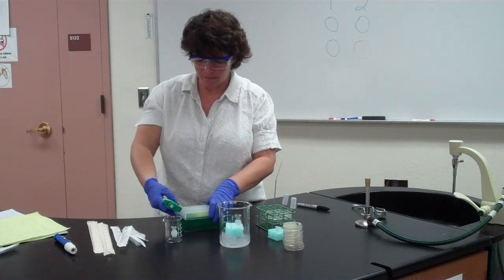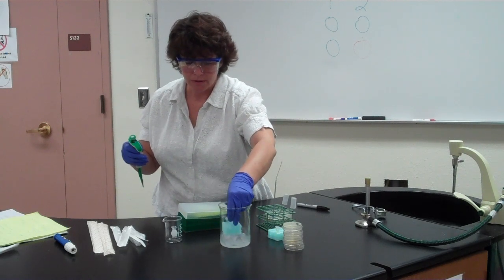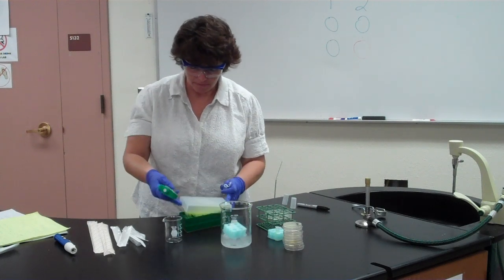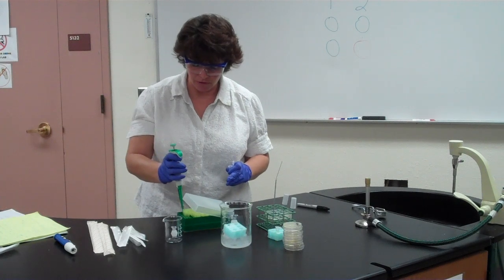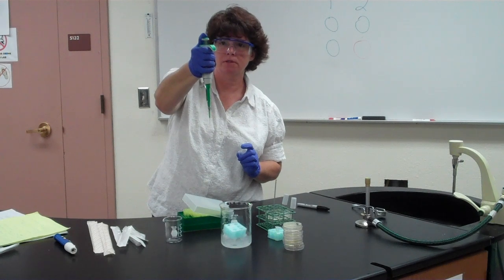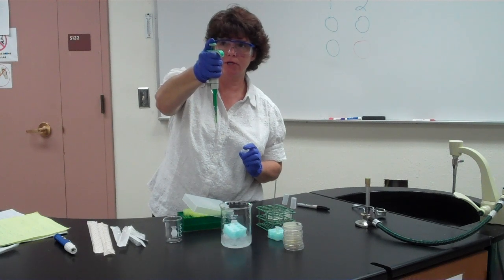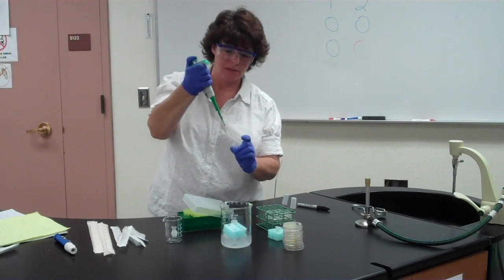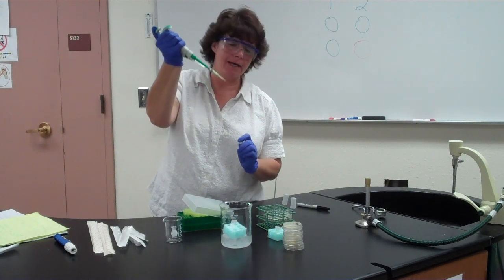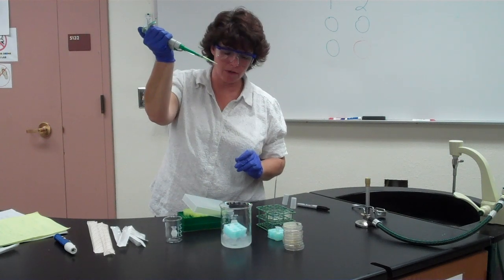So we're going to aliquot 10 microliters of our plasmid, which will be in another microcentrifuge tube, labeled plasmid or P or something. I'm not sure how it'll be labeled. Okay. 10 microliters is a very, very small quantity, so we don't use a regular pipette. And when you use the pipetter, there's two stops. I can press down and I feel resistance, but then I can press further. When you go to pull up the liquid, you go to where you hit your first resistance, put it in the tube, and slowly let it come up. And you can't see what's in here, but it is only that amount, the very tip of the tip. It is a very small quantity.